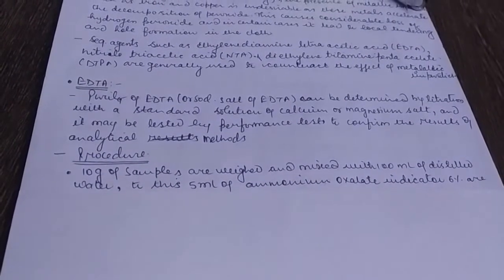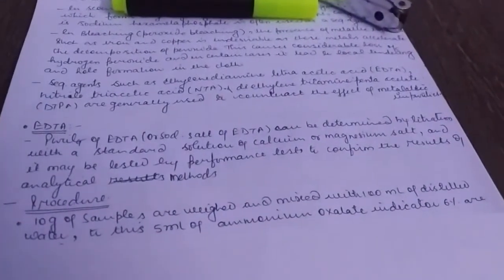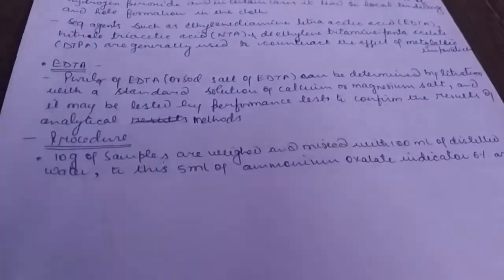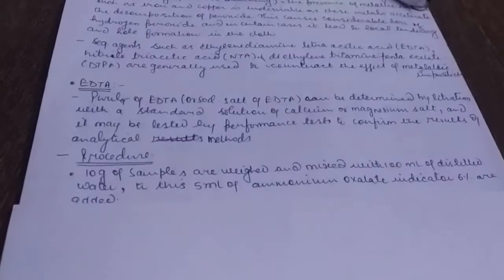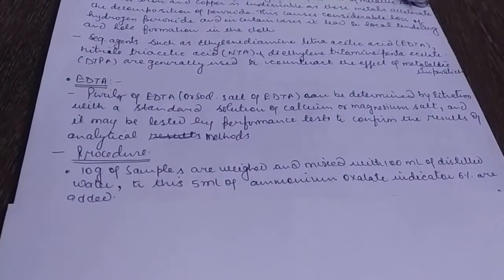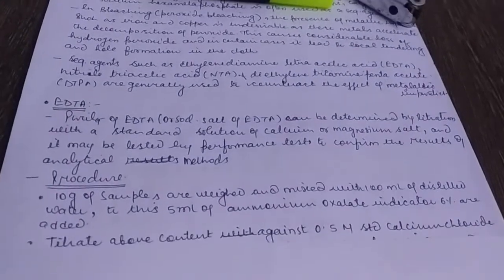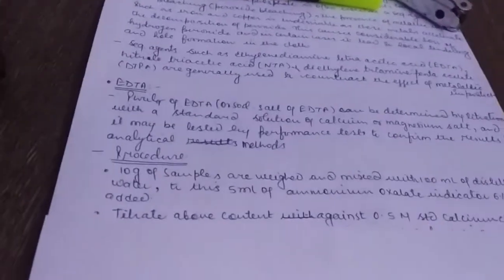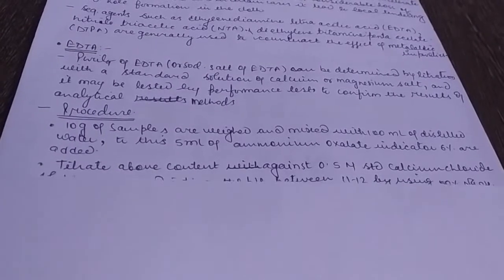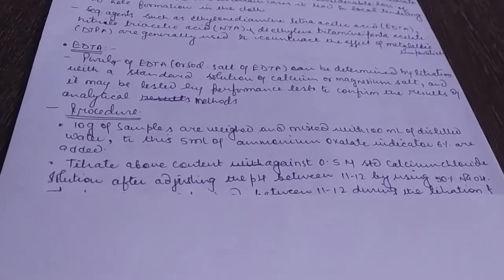In the analytical method, first we will discuss the procedure, the EDTA analysis. For EDTA analysis, 10 grams of sample is weighed and mixed with 100 ml of distilled water in a 200 ml flask, and to this 5 ml of 6% ammonium oxalate indicator is added. Mix it well, and then titrate the content against 0.5 molar standard calcium chloride solution after adjusting the pH between 11 and 12 by using 50% NaOH.